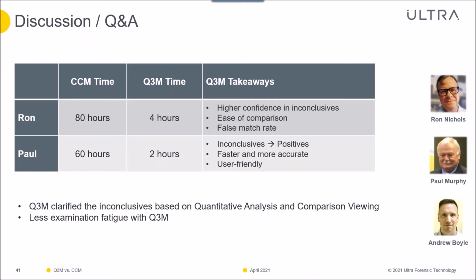I see it entering in side by side with comparison microscopes. I mean, there's still going to have to be internal validation with respect to examiners. We've built our entire data set on using a conventional comparison microscope. You know, we look and make determinations on whether or not two bullets share a common source by evaluating what we're observing against our best known non-match, and is this consistent with what we expect to see in known matching conditions. Everything has been developed using conventional comparison microscopy.